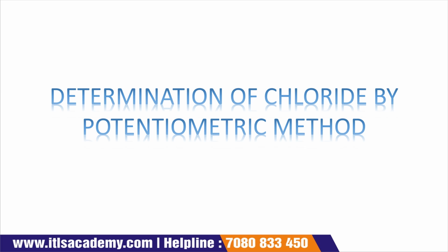Here we are going to discuss the determination of chloride by using a potentiometric method. So let's start today's lecture.